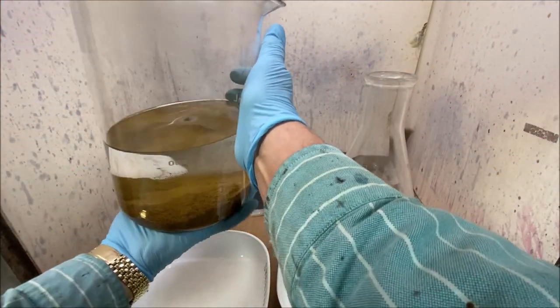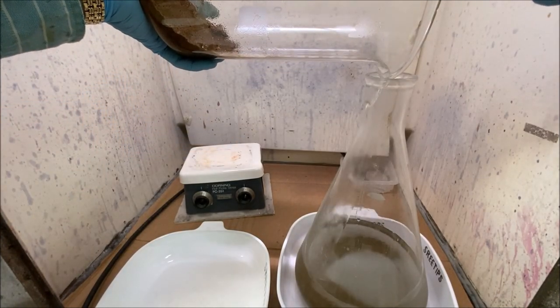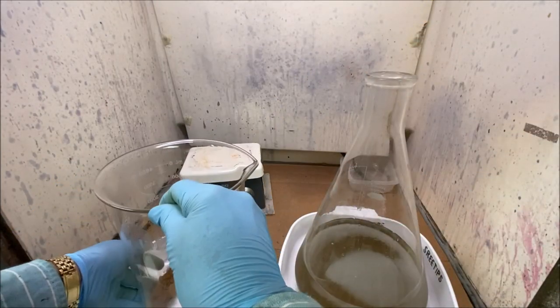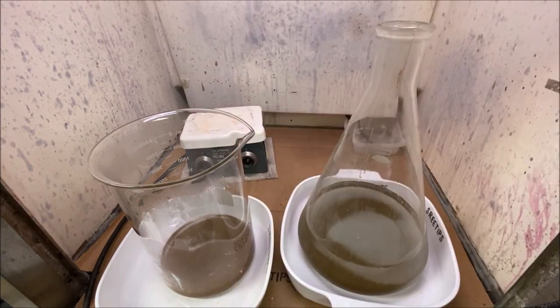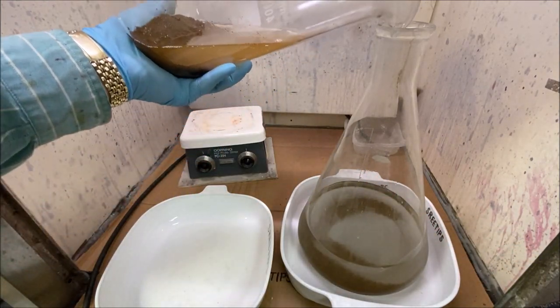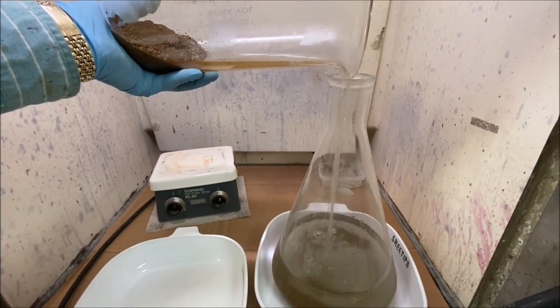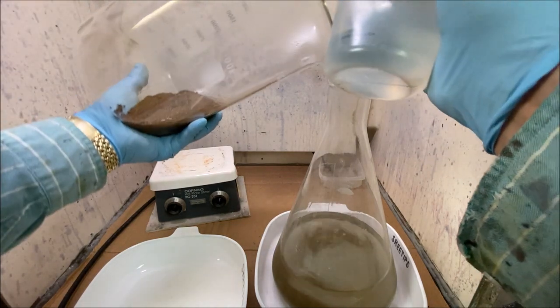What we're going to do now is pour off this waste solution into this beaker. A little of the gold will have a tendency to get poured off with this waste solution, and that's quite all right, because we'll recover any gold down at the bottom of that beaker or this flask here. Now I'm going to rinse the gold off with a little bit of hydrochloric acid, and we'll pour that rinse right off into this temporary waste container. Rinse it with a little bit of water here.